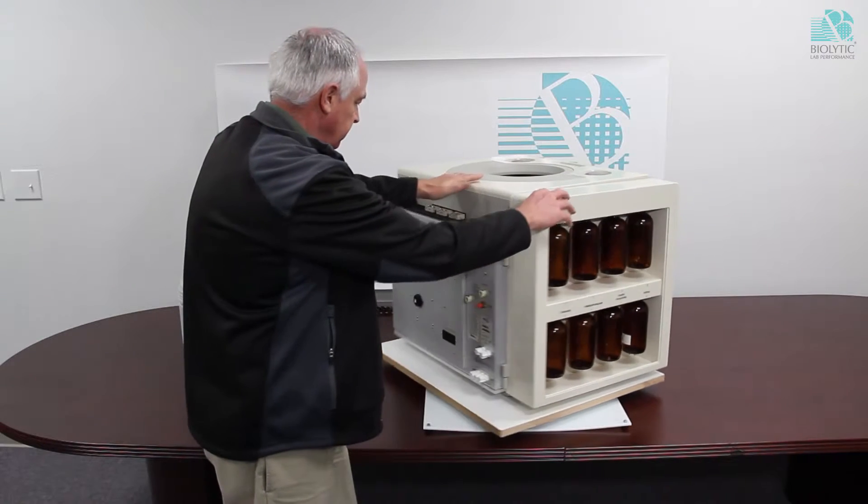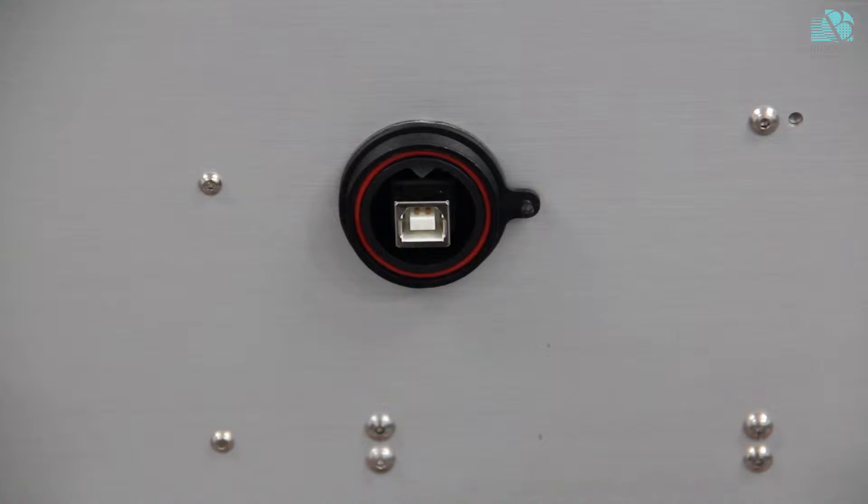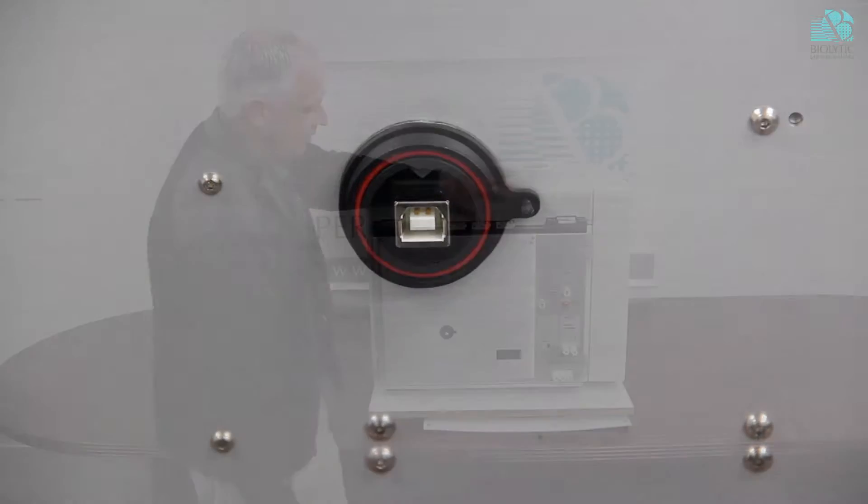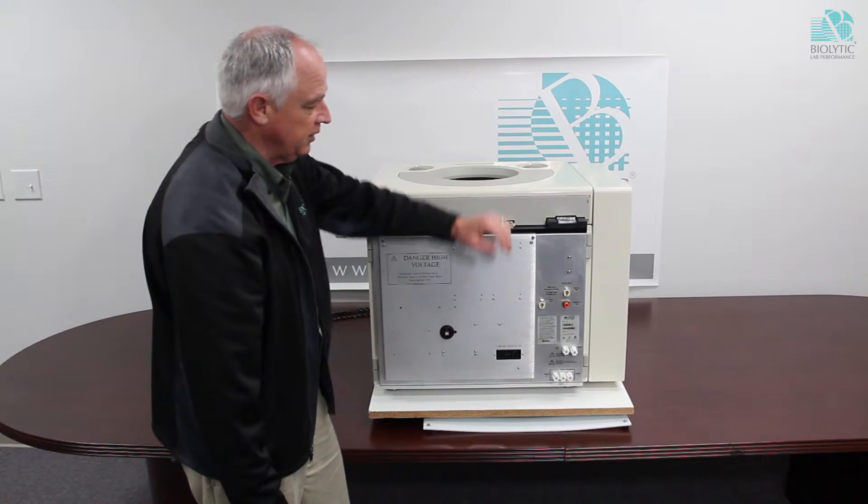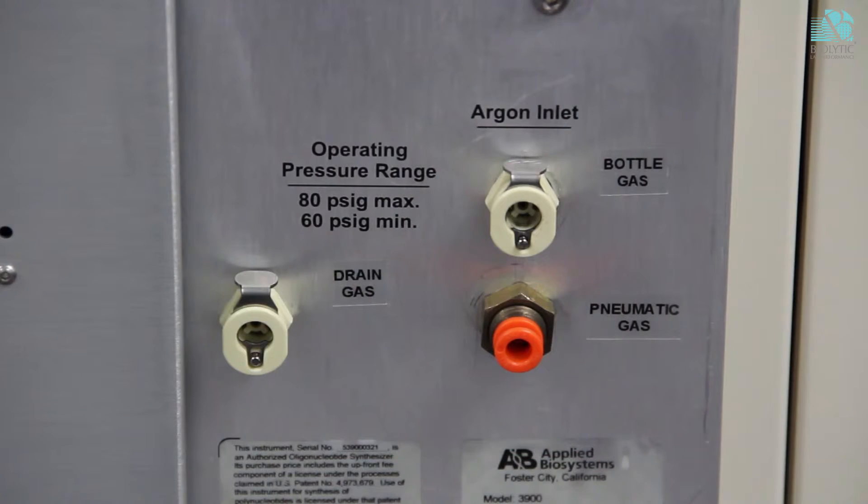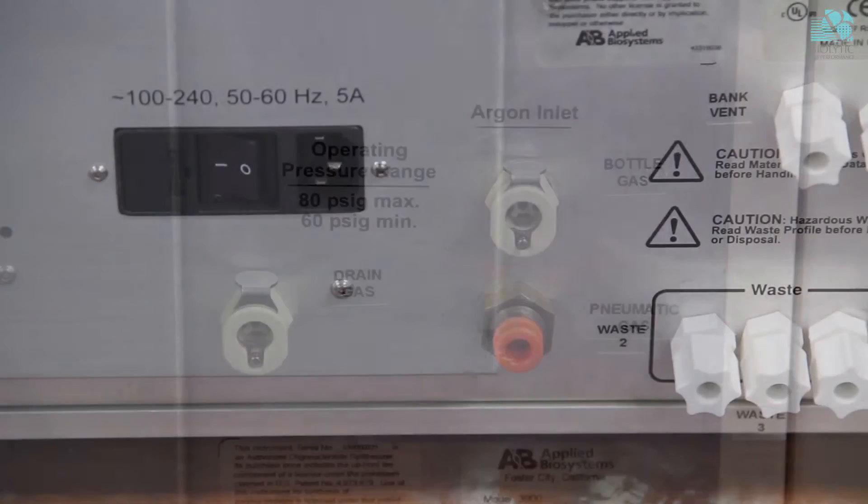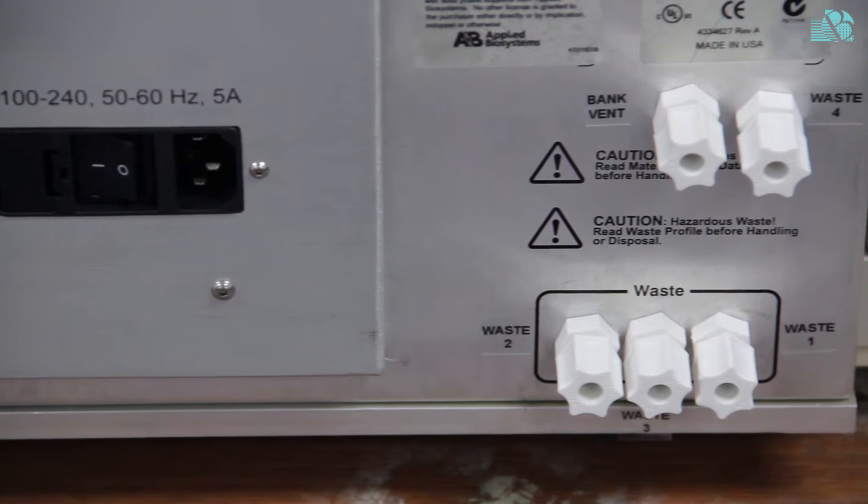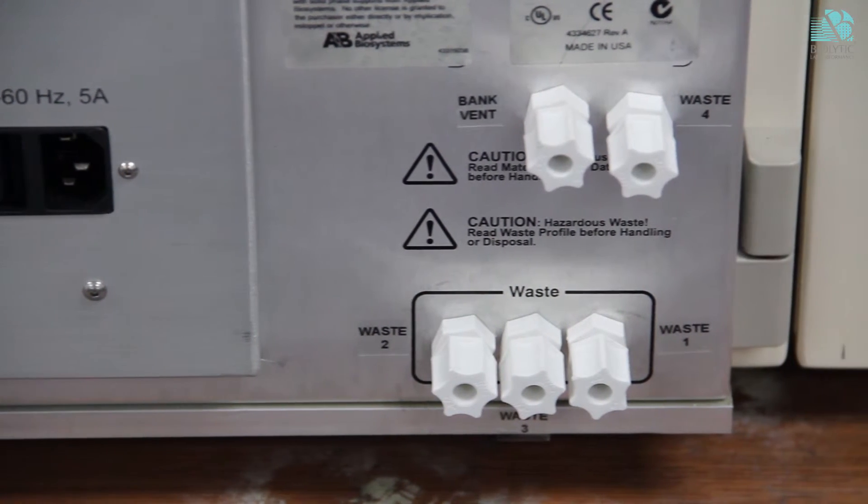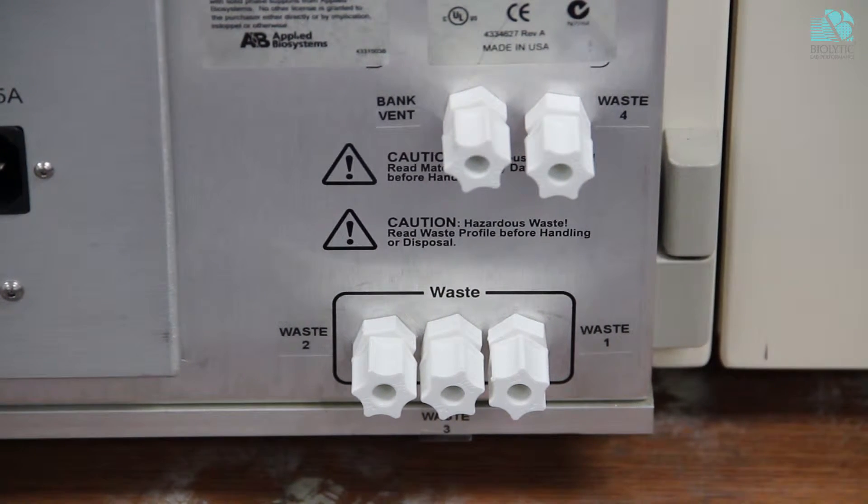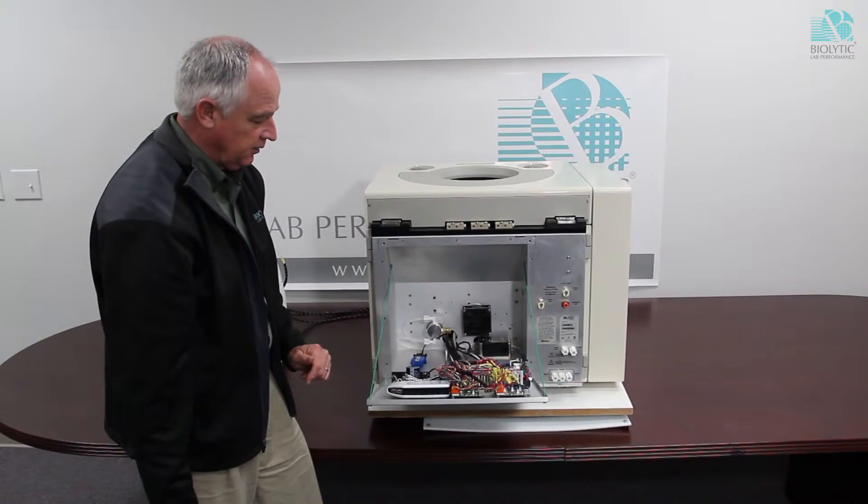On the back of the instrument you can see there's one connection here for USB. We provide the ability to have three different types of gas. One is for pneumatics, the other is the bottle pressure and then there is the drain gas. Down here we have our four exit ports for waste and one for vent. So this is the new rear panel that we install.